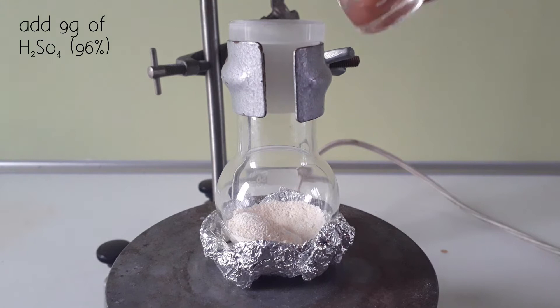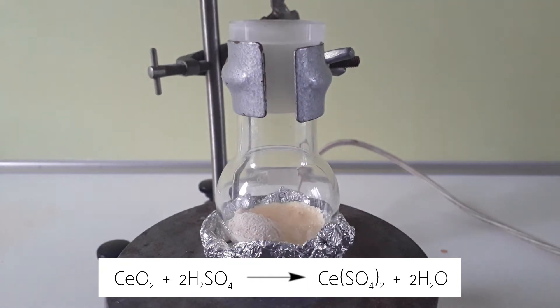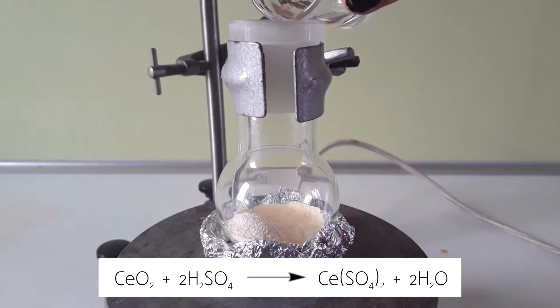Then I add 9 grams of 96% sulphuric acid, which is an excess of around 3 grams. I do this so that there is enough liquid for the stirring to work properly.